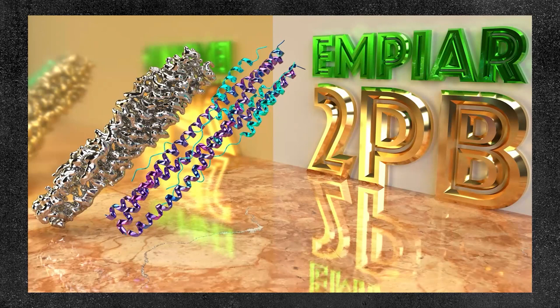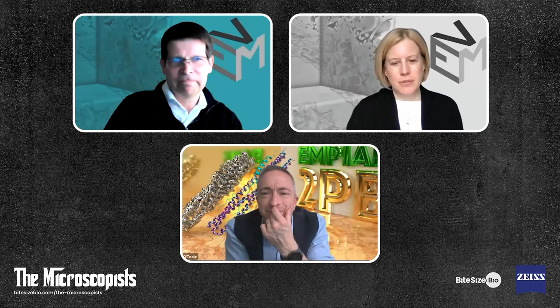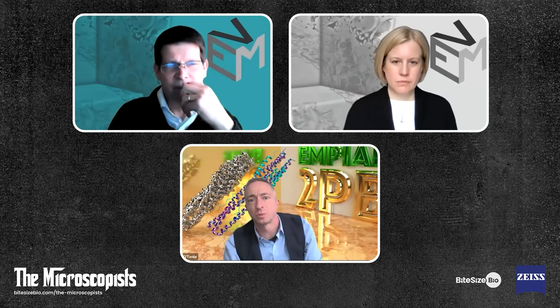And that means that the data gets out to other scientists, not just biological researchers who might want to reuse it and reanalyze it, but also computational scientists who might want to develop new algorithms to analyze that data. And EMPIAR is growing very quickly. You can see this from, I don't know which way I'm pointing, behind Pete, it says 2 petabytes. So they reached 2 petabytes worth of image data in 2022, and they're almost up to 3 petabytes now. And I'd imagine that's not all the data that's been generated. That's just what's been uploaded.